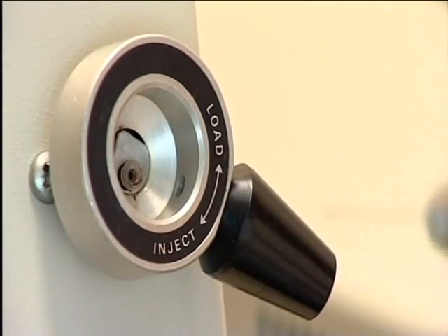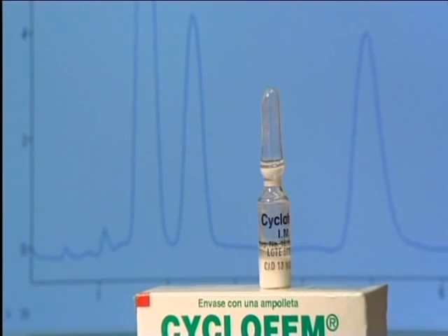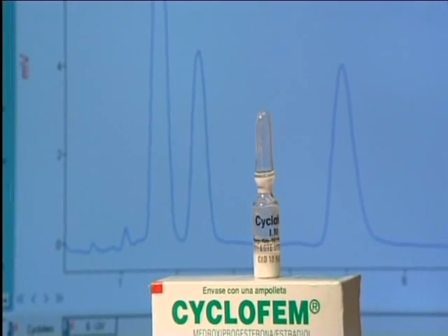The more polar component comes off the column first, followed by the less polar. The peak at retention time 1.5 minutes represents other ingredients used in formulating the product. This is the pharmaceutical product, and behind it, its chromatogram.